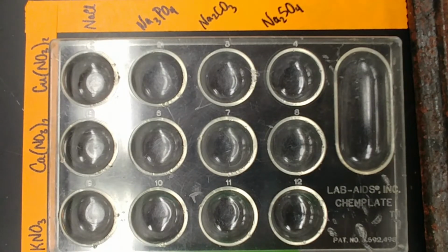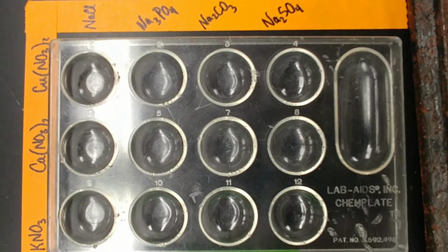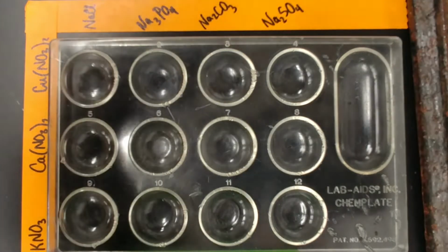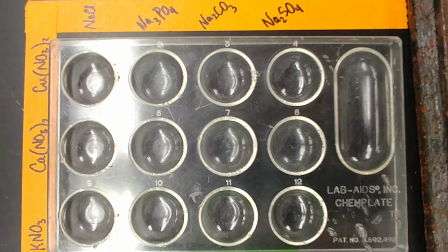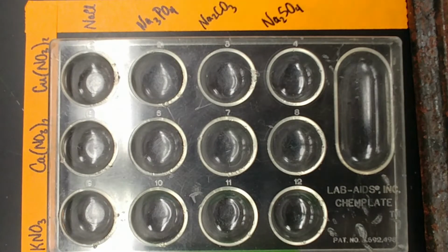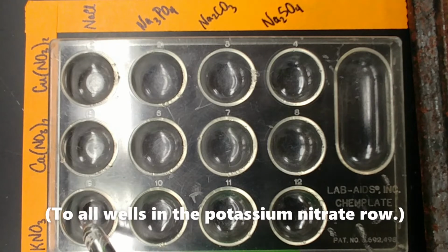Okay, so this setup has a well plate with the different reagents that we're using arranged in an array. You should have something similar in your report sheets. We are going to be doing this on a black background, so it's a little bit easier to see the precipitates when they occur. First thing we're going to do is add the potassium nitrate, and we're just going to go ahead and add that into all of our wells. Just a couple drops is all we need.